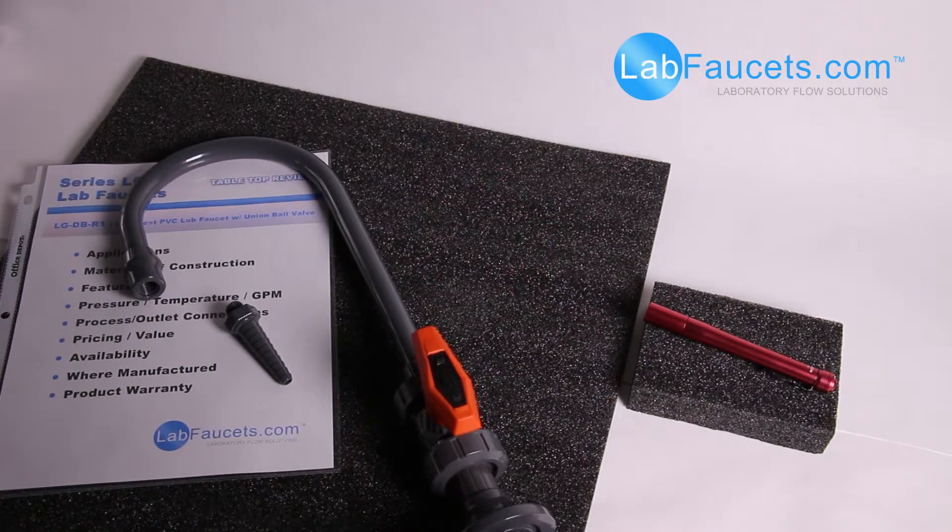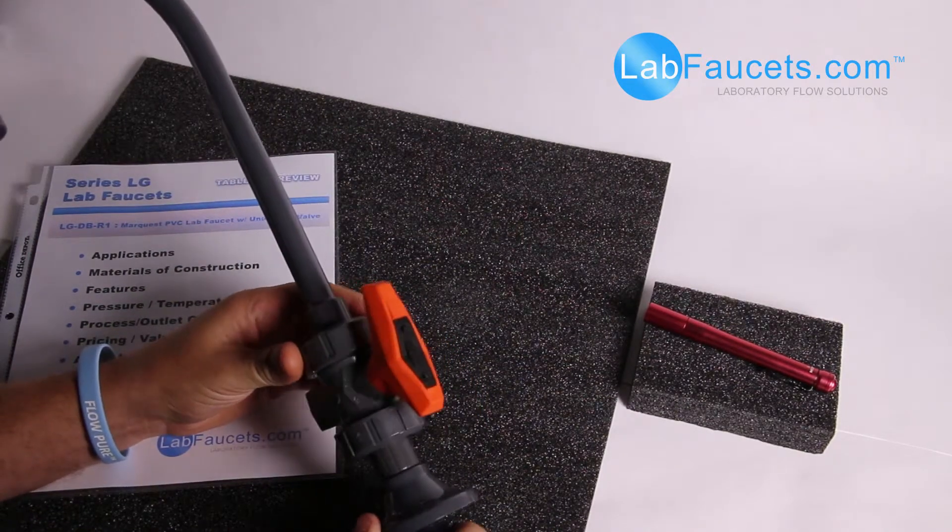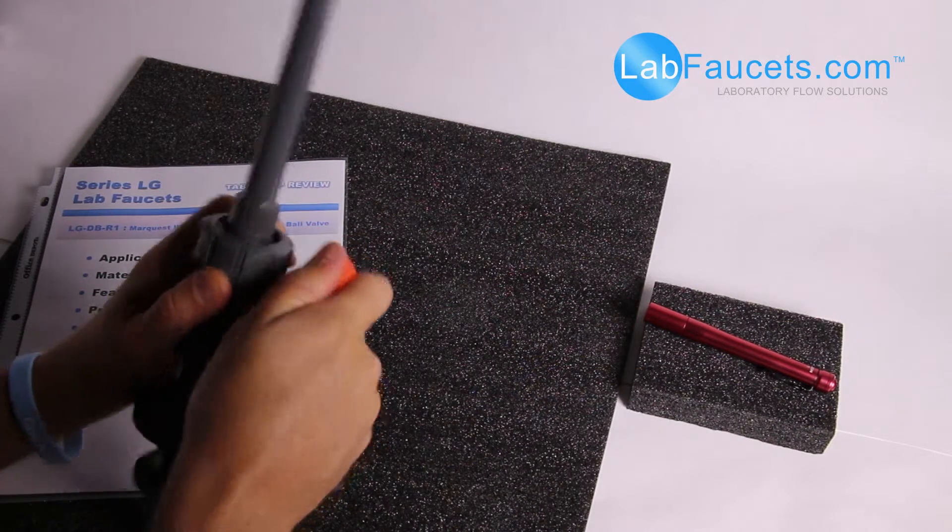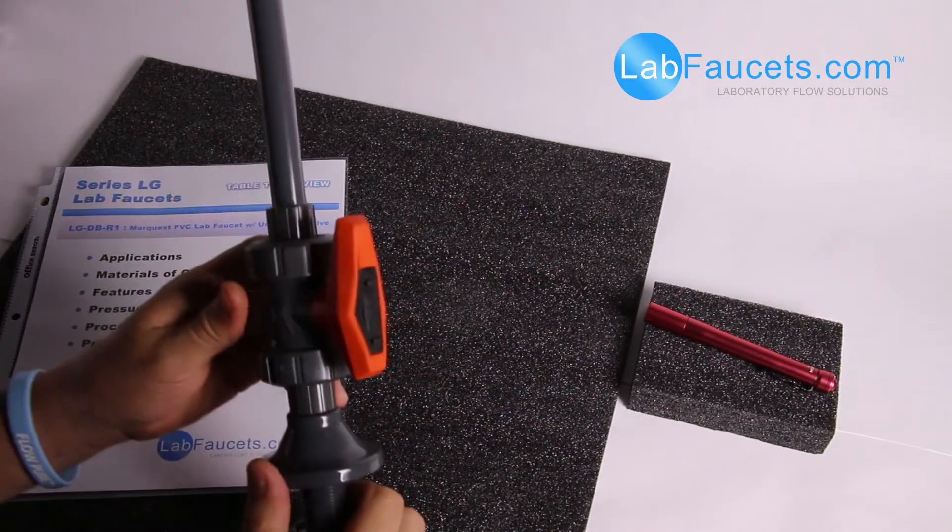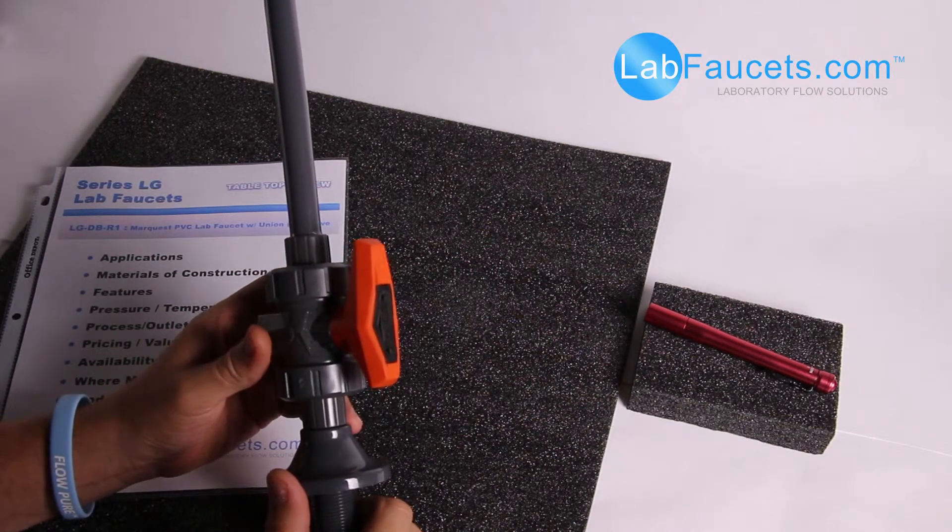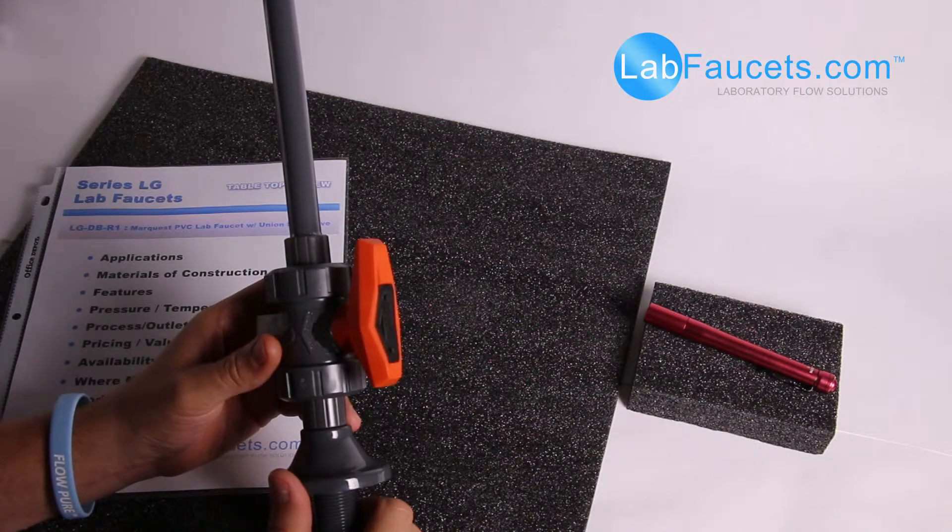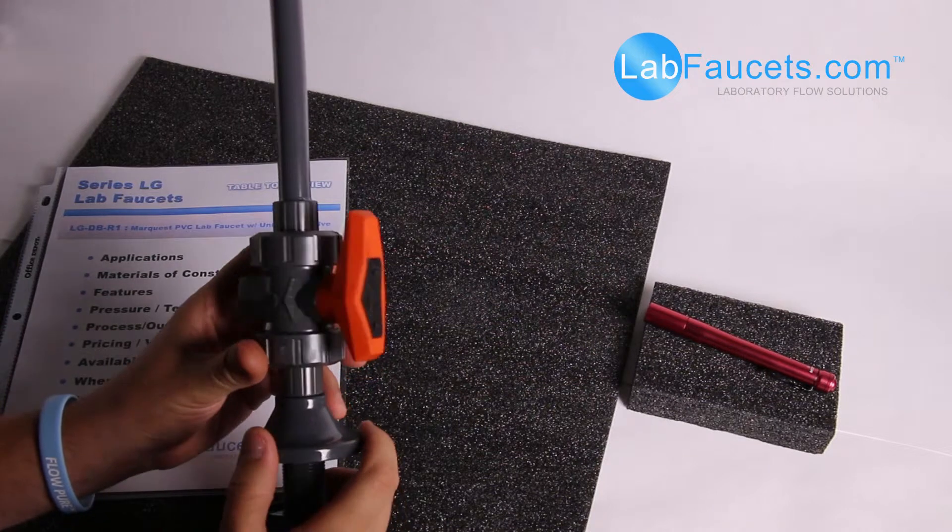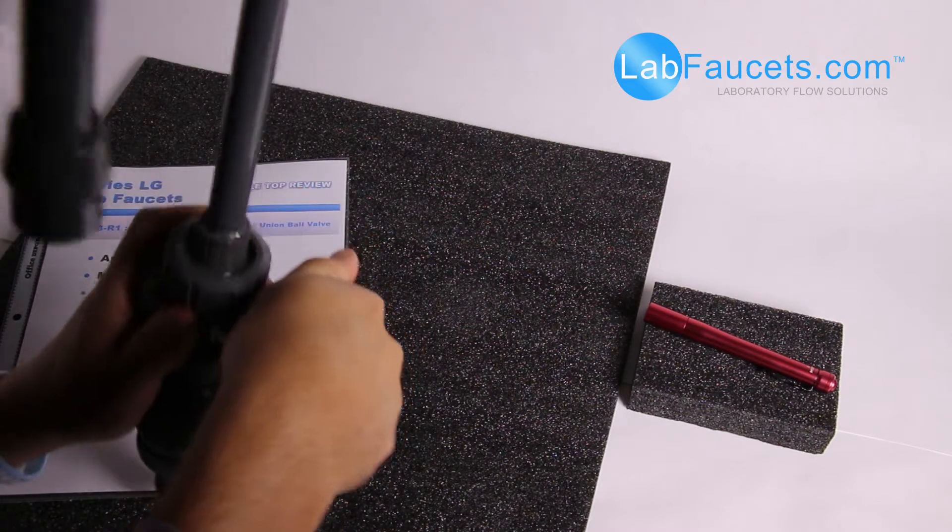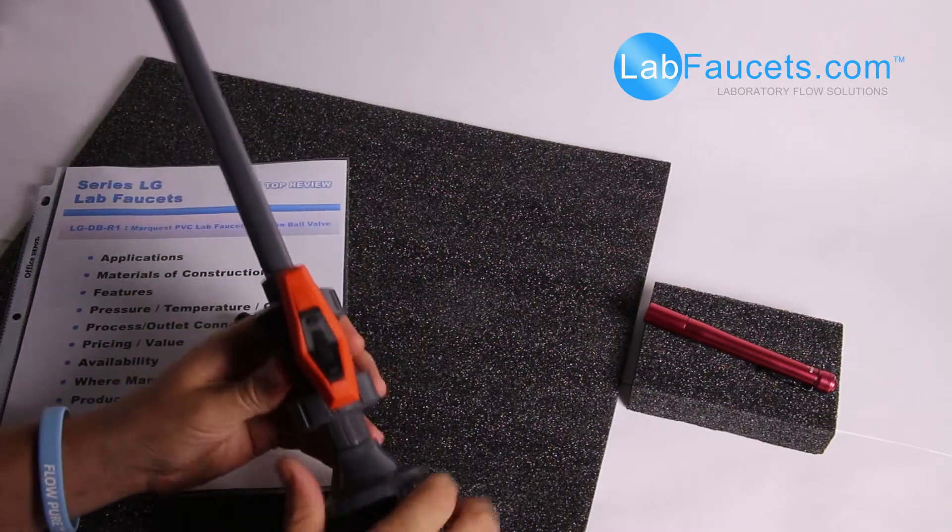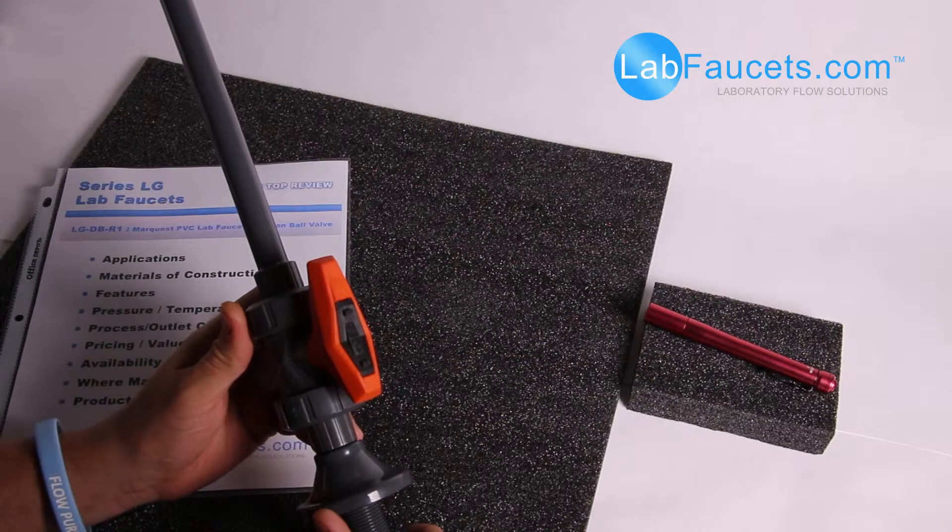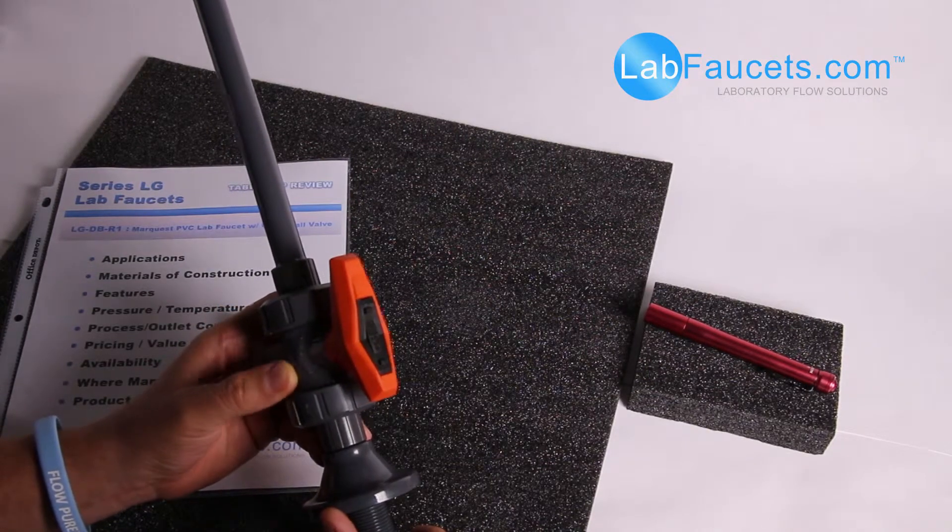Value, well, the reason there's value here is having a PVC ball valve for quarter turn on-off. What happens in the industry is a lot of DI water, PVC lab faucets will use a more economical ball valve. And what happens is that ball valve is not designed to be turned on and off all day long. And what happens is the handle will basically either shear off or strip the interference connection of the handle to the stem.